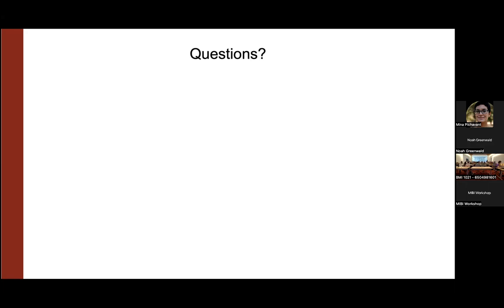Okay, let's say you have a new batch of antibodies from an antibody clone that's already been validated before. How does this workflow change? All right, if you have a new batch of antibody, in our lab we go through some basic QC steps for every antibody that comes in, which I have included here. First, make sure that the antibody is still carrier free, that they didn't accidentally include a carrier protein in there, and then that the vendor actually provides the amount of antibody that they say they did. When you're conjugating the antibody, you need to make sure that there's a certain amount of antibody material in that reaction.